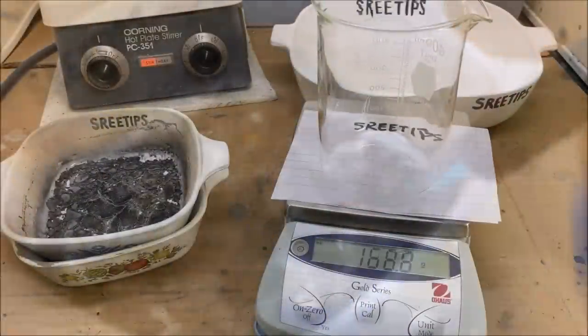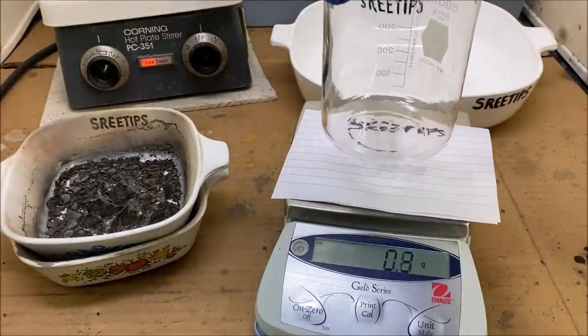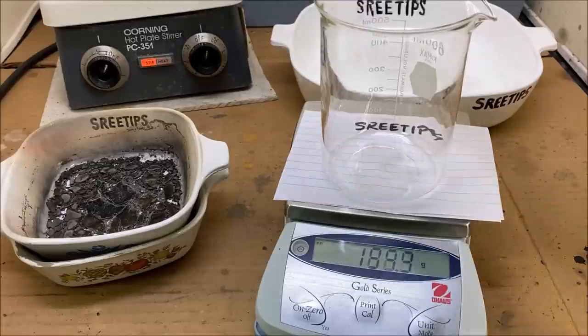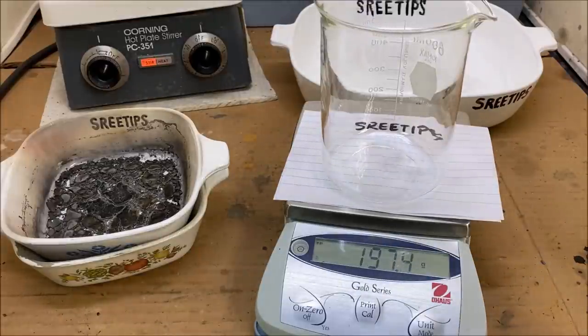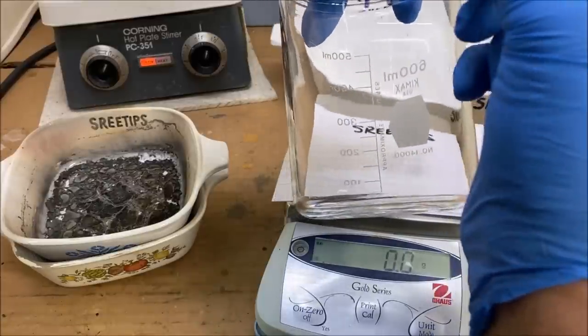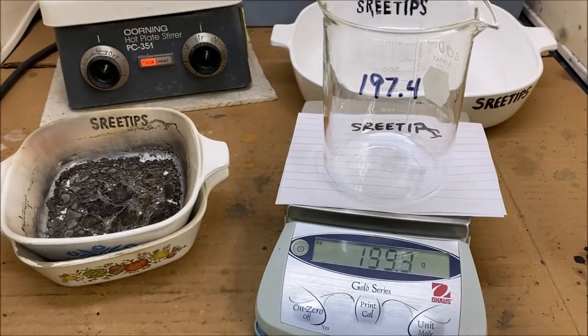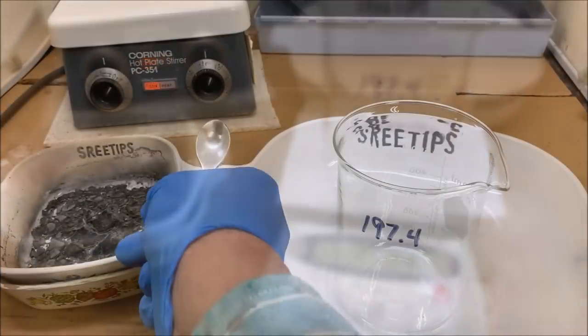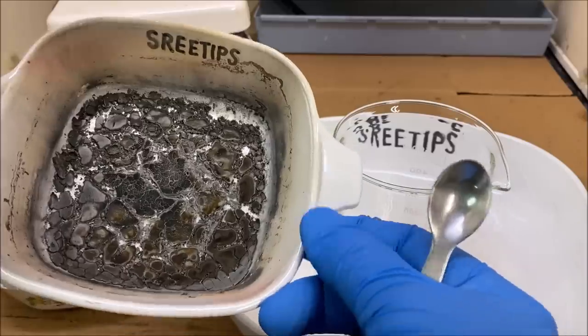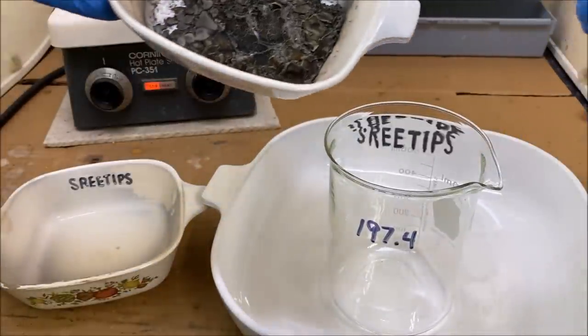Let's put a beaker up here, get a weight on it, 197.4. I'm gonna write that right on the side of the beaker. Now we're going to take our platinum metal here and add it to this beaker carefully.